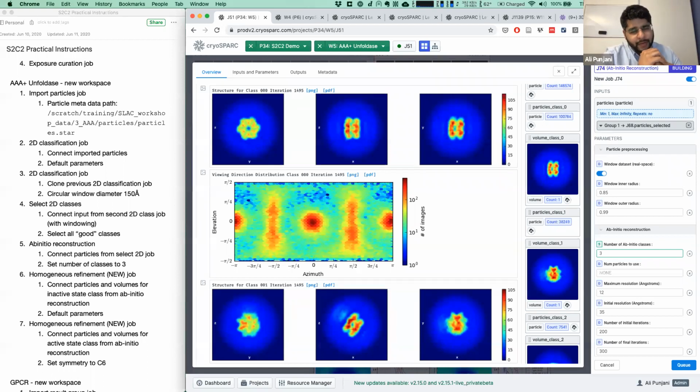It is notable that in a lot of membrane proteins, and we'll see this a little later on with 3D variability, the micelle itself presents a huge amount of heterogeneity. So the micelle may come in different shapes, sizes, twisting, bending, and the position of the protein within the micelle or nanodisk, what have you. If it's a nanodisk, the rotation of the apolipoprotein around the target molecule. All of those sources of heterogeneity are often quite large, and depending on the conformational change you're looking for, may swamp the conformational change signal from the protein itself.